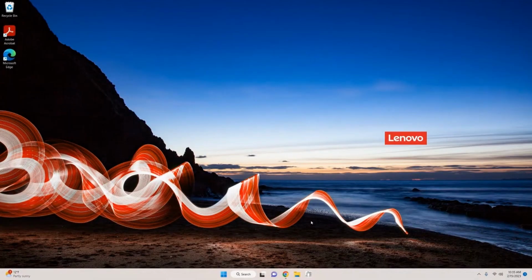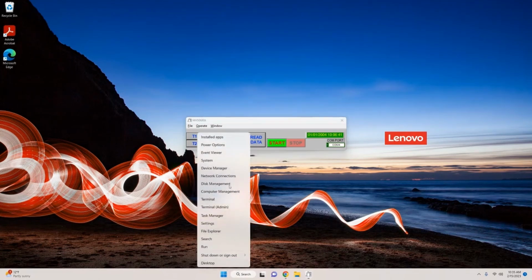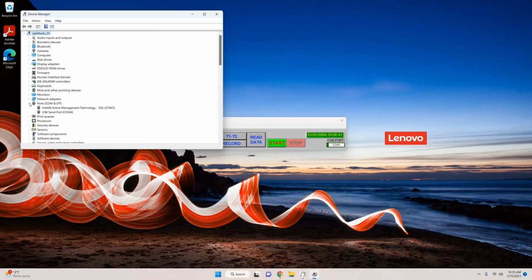While the sample is heating up, you want to make sure the thermocouple reader is working with the computer. To do this, you'll first need to select the proper COM port. Open Device Manager and select Ports. The thermocouple reader should be identified as a USB serial port. In this case, it is in COM4. And so if we go back to the HH506RA software, we will see that COM port 4 is selected. So we should be good to go.